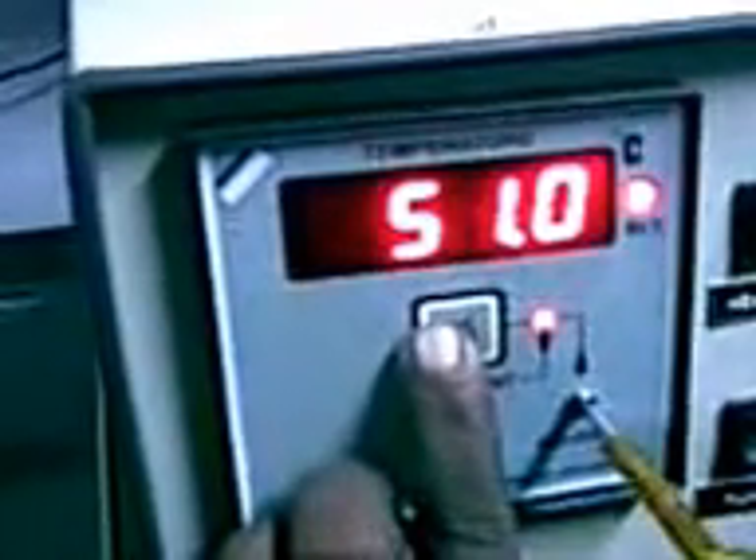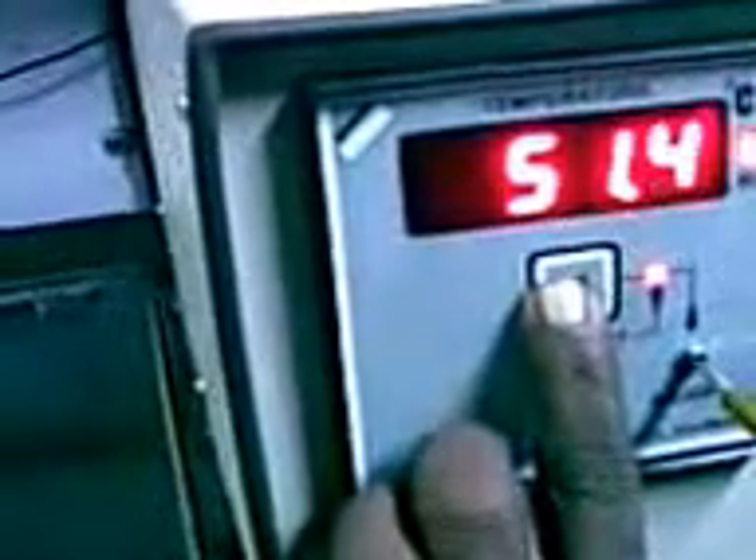First, switch on the tester. Then switch on the temperature controller. Now it's on. Preset temperature is 50 degrees. If you want to increase or decrease, press the button. It's been set to 51, then 52. Now we will keep it to 51 degrees. It's on 51 degrees. Now 50 degrees — the relay has started. Temperature is working. Heater is working.